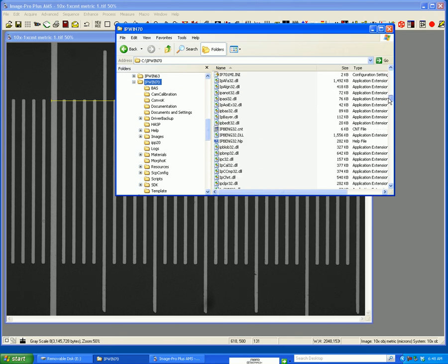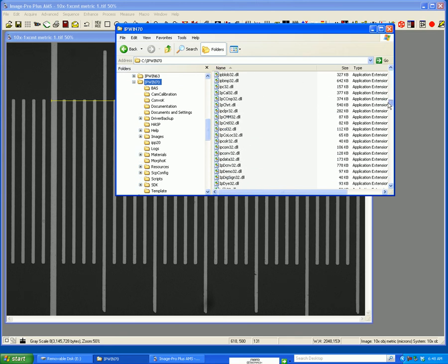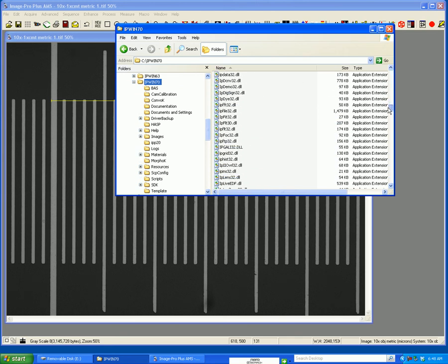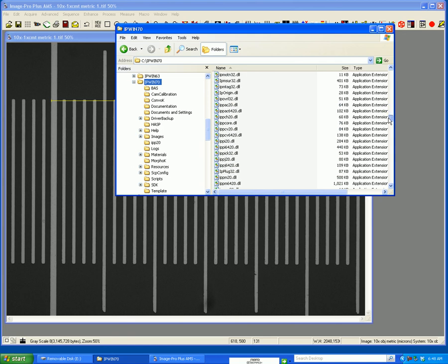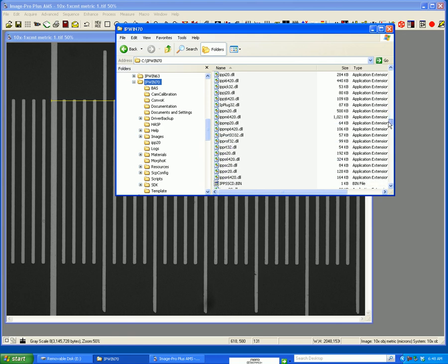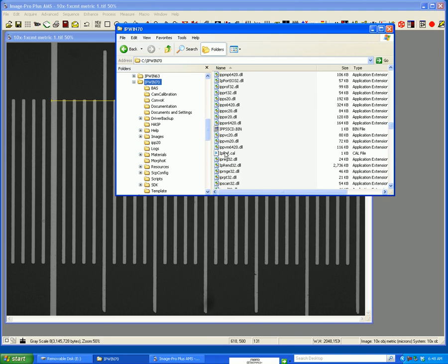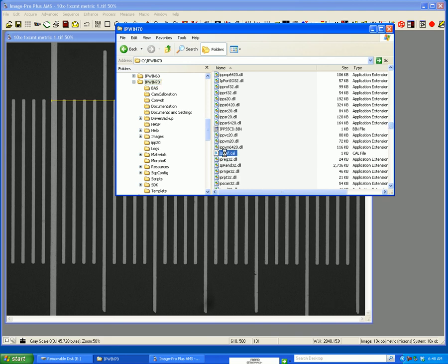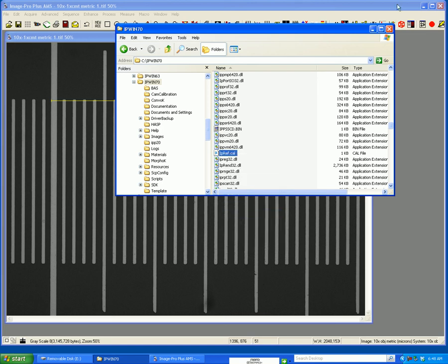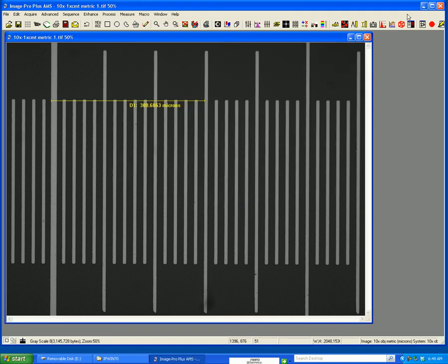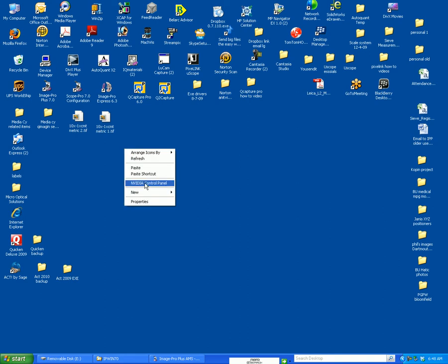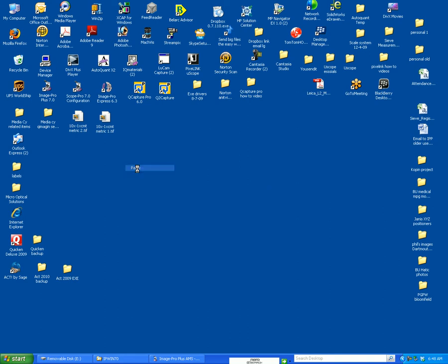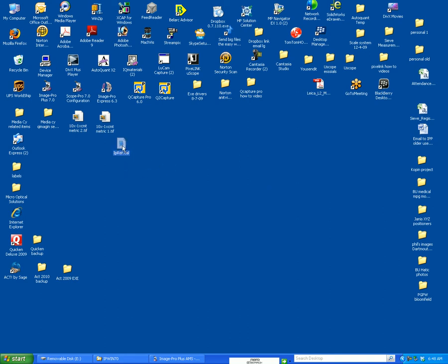I'm going to find ipref.cal. Right here. I'm not going to cut this out. I'm going to copy this and I'm going to paste this again. I would paste this into the folder.